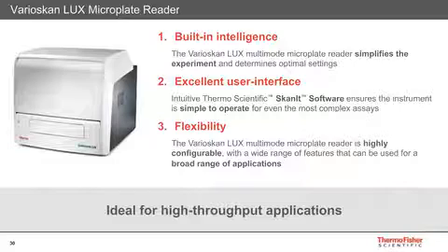The program will guide you step by step for the addition of standards and the samples and for their measurements. The program then uses the equation of the standard curve and spits out the concentration of the unknowns without you having to do anything.